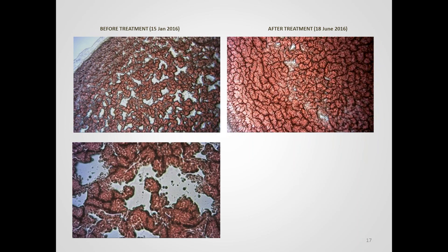And in this image, we've zoomed into one of those white areas. So we're looking at it at a higher level of magnification, and we're looking at all those little structures, all those spots within the white areas. Now these are things like sialic acid and Heinz bodies, and we often see those within these white areas as a result of tissue damage taking place as a result of inflammation and over acidity.